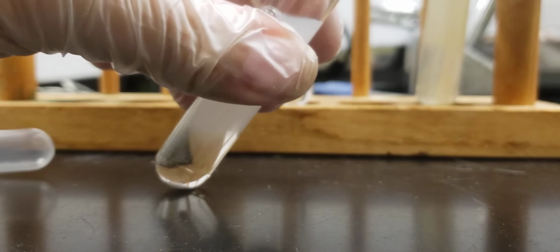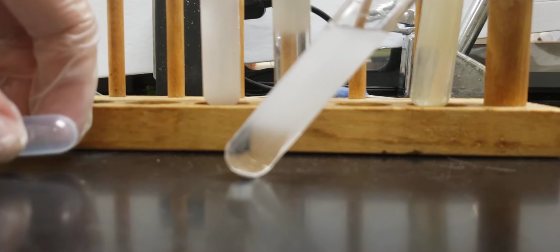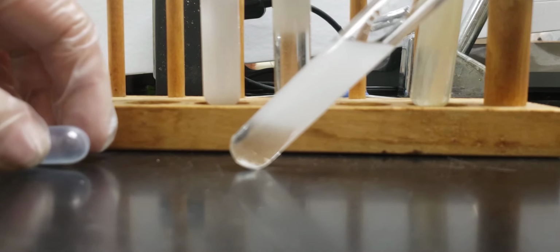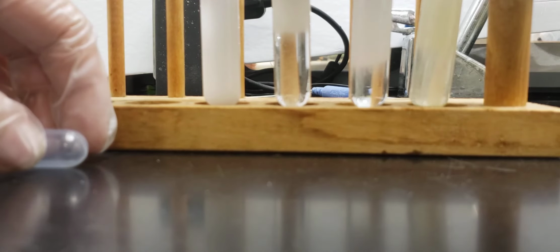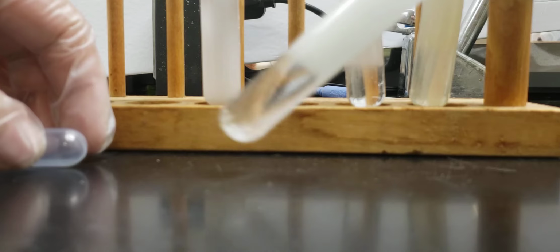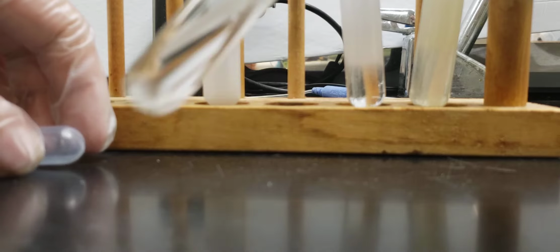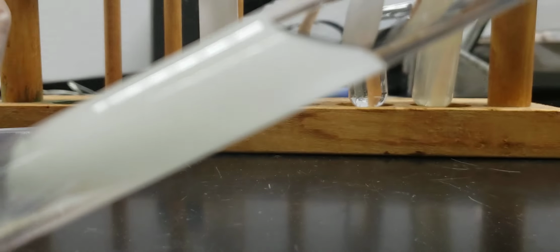In fact, we can end up seeing that it looks like it's been diluted just a little bit more, which is what we would expect to see as some of the stuff that was the solid is dissolving again. Okay, the same thing that we can also see at the bromine for test tube Z, that we aren't seeing a large change, and we're not seeing all too much of a change here.